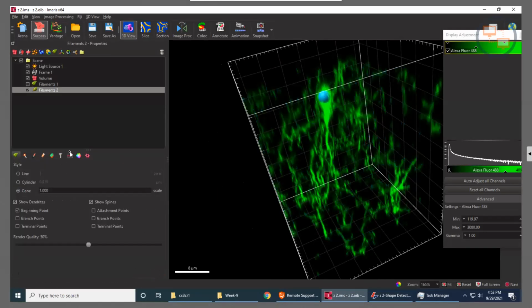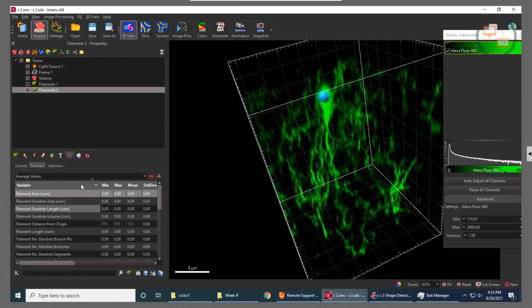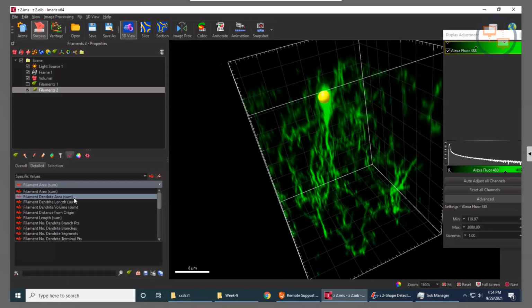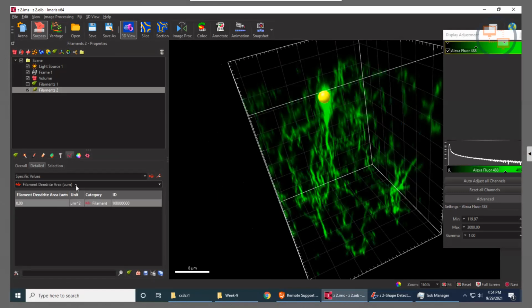So I just want to bring this point down. When we look over Zoom, the rendering does not look that good, and that's because we are on a remote connection. Otherwise, when you're on the workstation doing this personally, it's pretty much flawless.